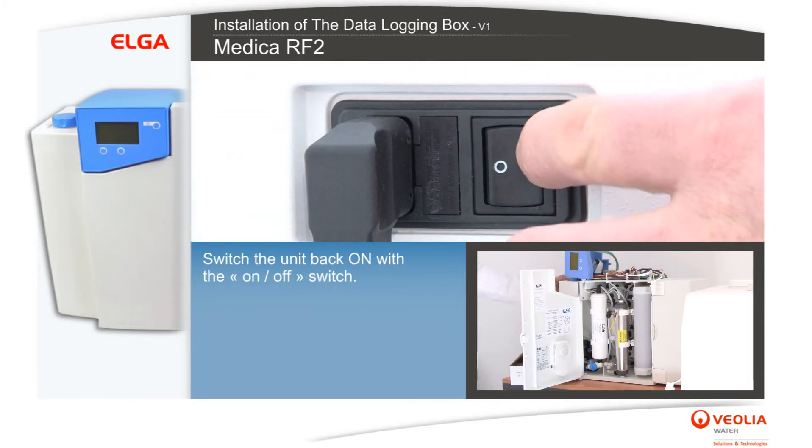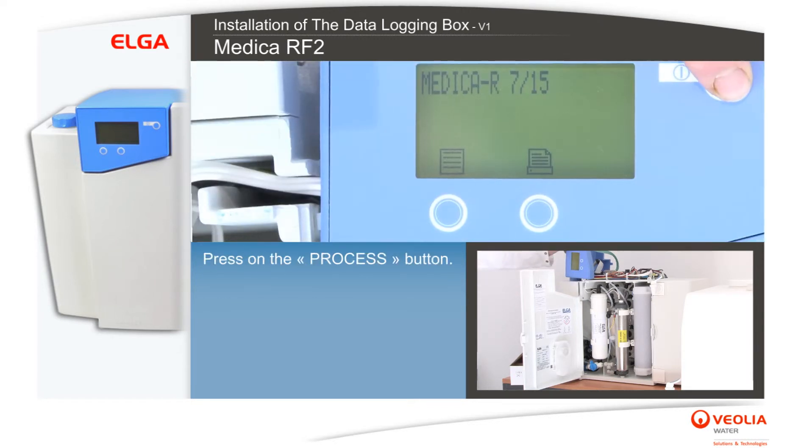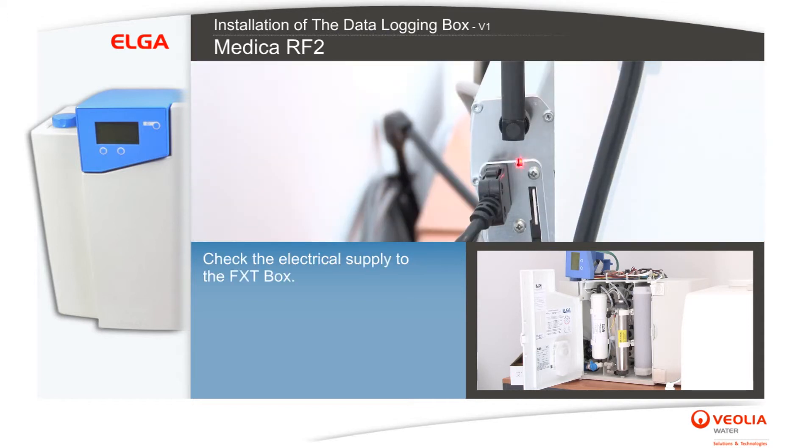Switch the unit back on with the ON-OFF switch and press the process button. Check the electrical supply to the FXT box and check its connection test, which takes approximately 4 minutes.